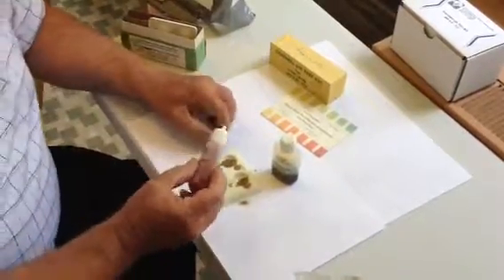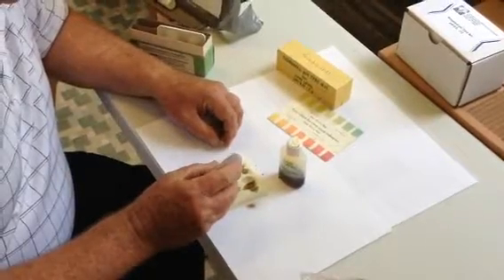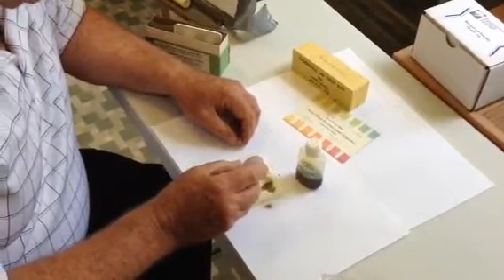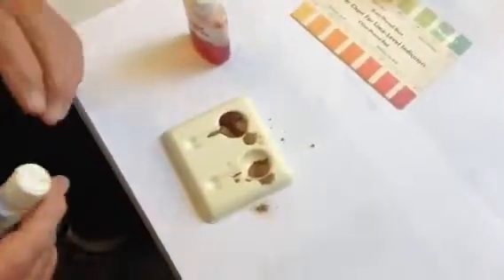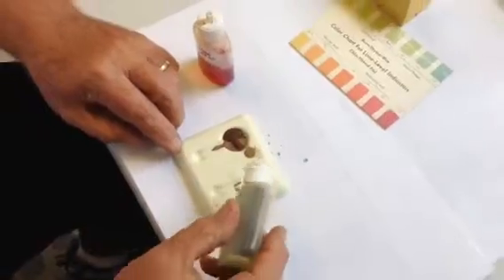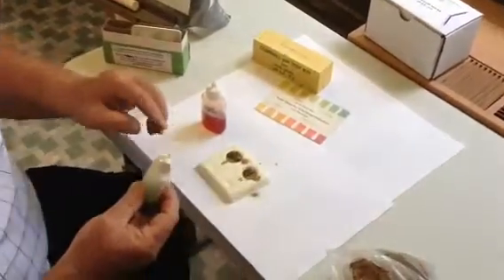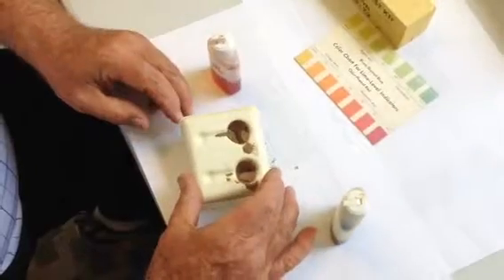One of the biggest mistakes that people make is by putting too much liquid into the soil and trying to test it accurately too quickly. It will puddle up and you won't get a good reaction. You can also see that this soil is so dry that the reagents just want to bounce off from it and not penetrate.